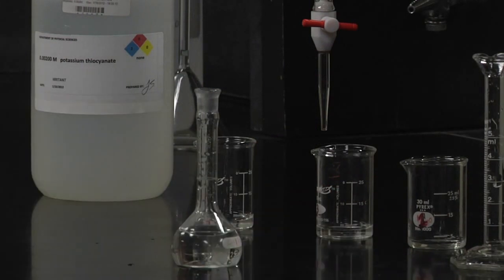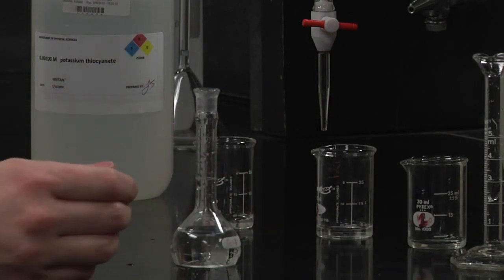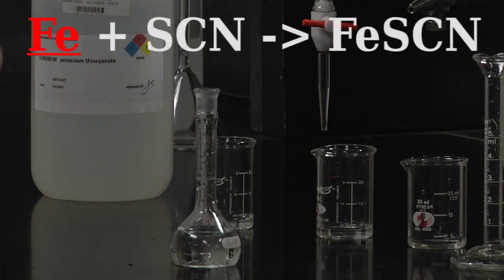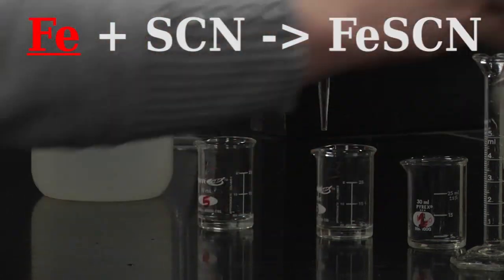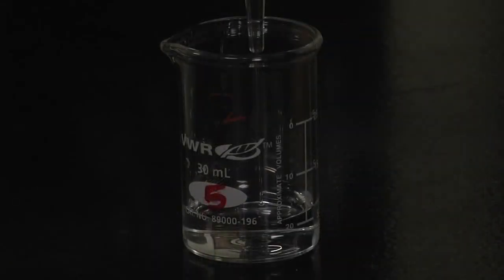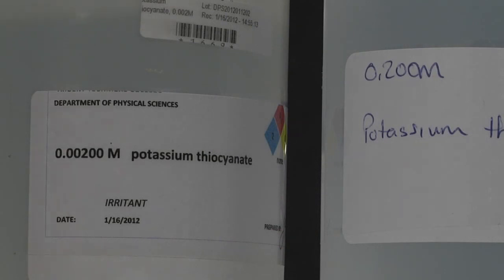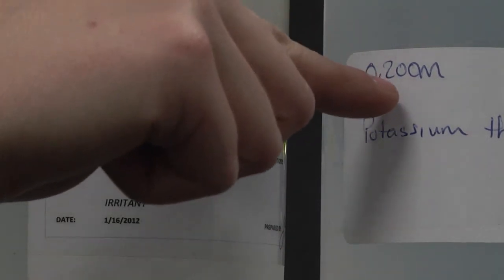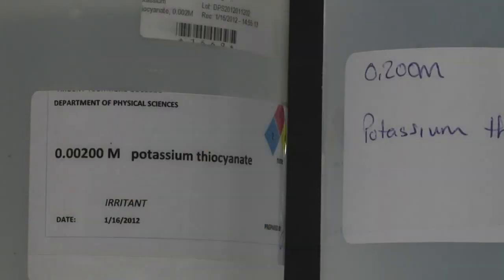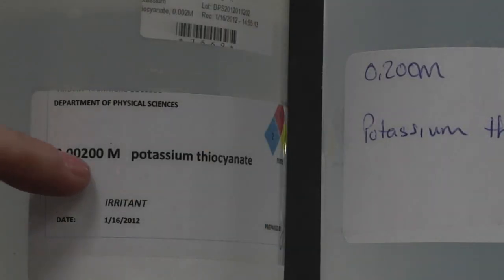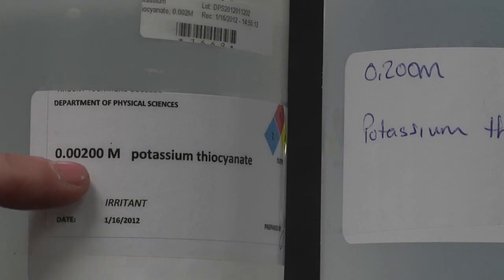If you're making table one solutions, you want to be working with 0.2 molar potassium thiocyanate, not 0.002. 0.002 is used in part two with the second table.